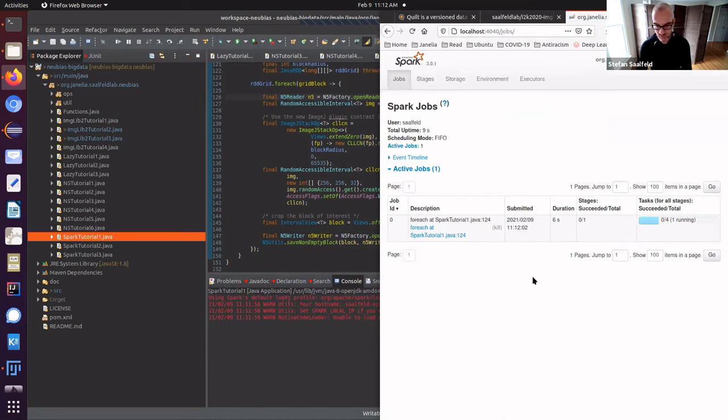And it's currently doing some work. And it should be finished in very little time. Because it's a relatively small data set, 4 CPUs are a good test ground for this, right? And then you can see it finishing at some point. And then we have a contrast corrected data set.